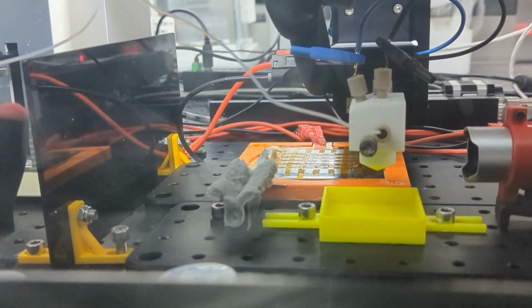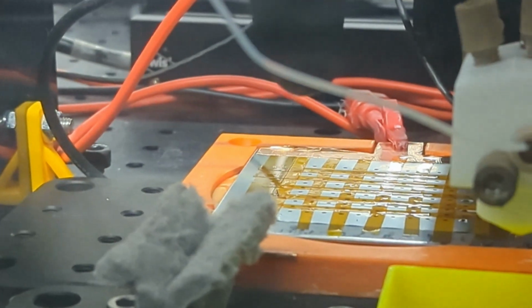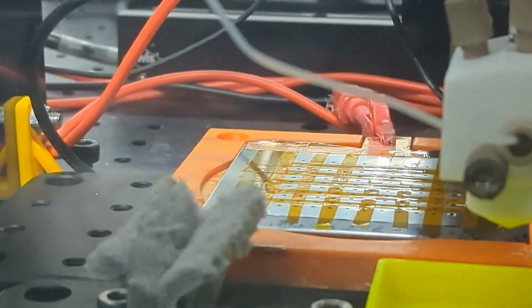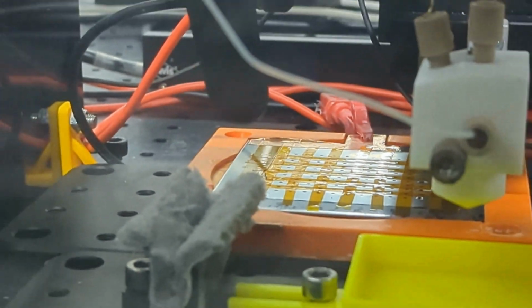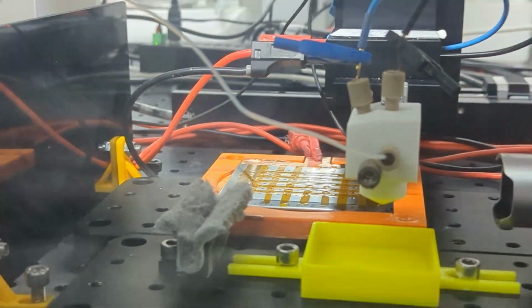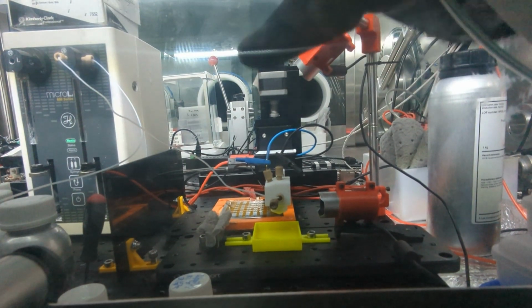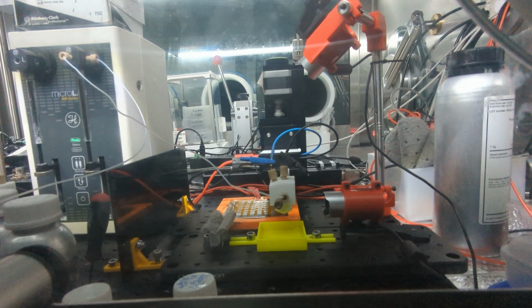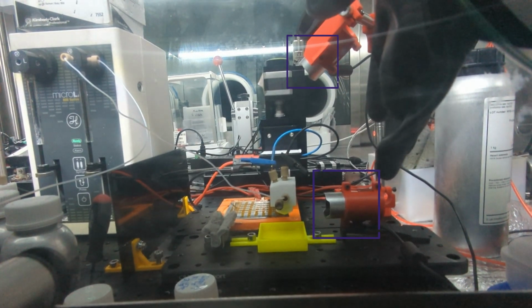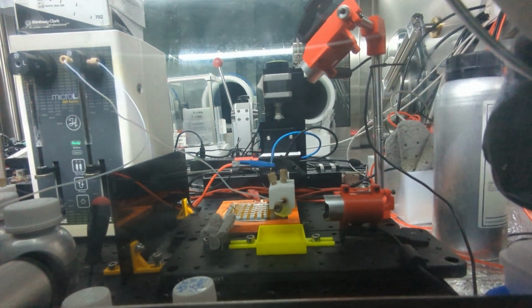Subsequently, the head relocates to any measurement area on the working electrode designated by the operator in order to execute the scheduled protocol. The working electrode is connected to a multi-channel potentiostat device from Metrohm company via a red crocodile clip. Once all electrodes are connected, the selected protocol is executed. Furthermore, cameras are strategically positioned to monitor the quality of the experiment at various stages and to prevent hardware failure.